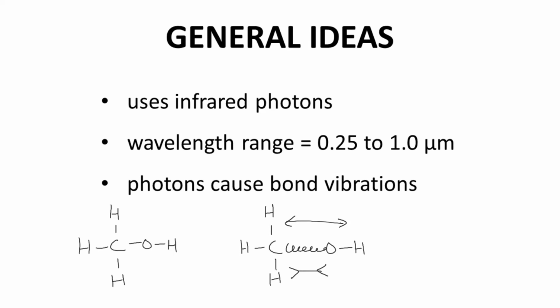compress. The absorption of the IR photon involves a specific frequency or wavelength that matches the energy of the bond. That absorption of IR photons can be detected and measured and interpreted as evidence that the analyte molecule, methanol, contains a CO bond. Let's see a sample spectrum.